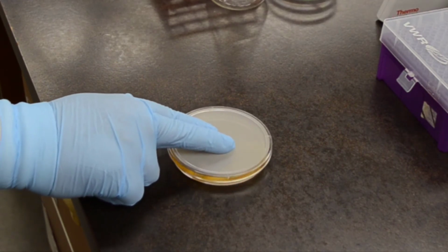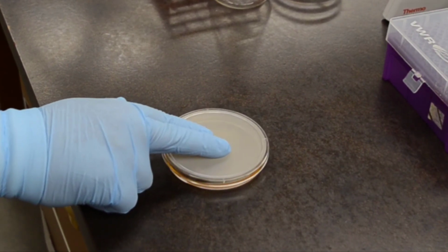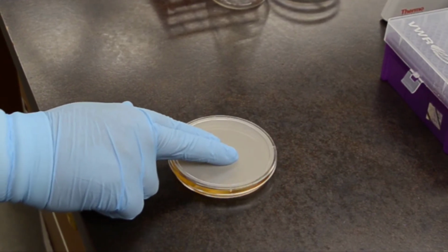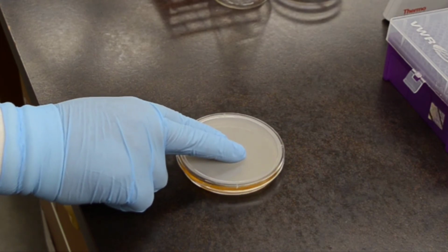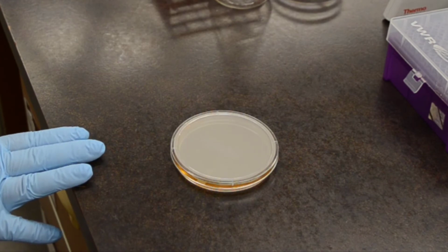When the molten agar has been cooled to below 60 Celsius, it can be safely poured into the dish with the culture without killing a significant number of cells by heat. Once poured, the agar culture mixture should be mixed gently but thoroughly by swirling as demonstrated here. Switch swirling directions once or twice to aid in complete mixing.